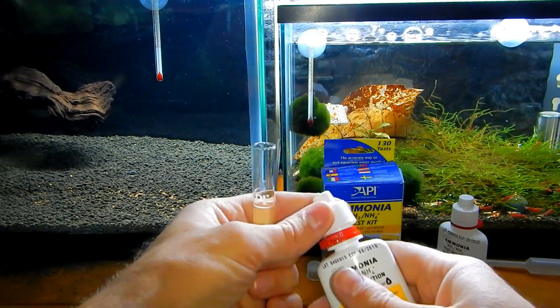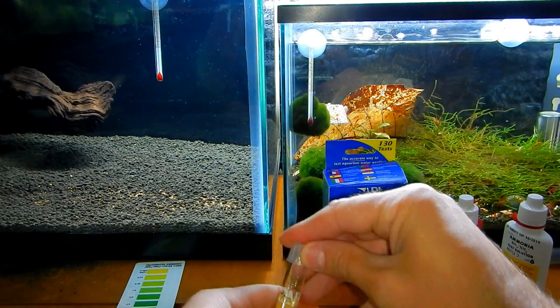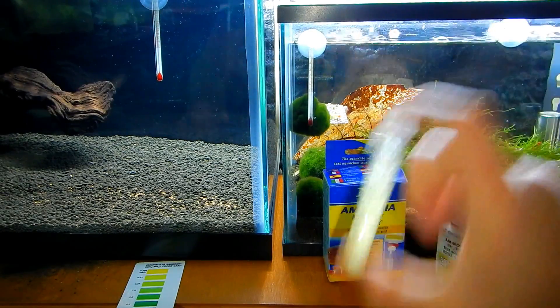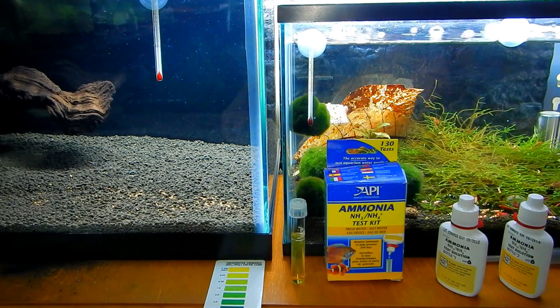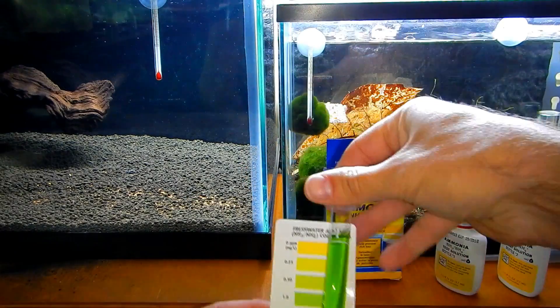Cap it, shake it for five seconds as they say, and then let it sit for five minutes. Okay, five minutes has passed and now we can compare the results.